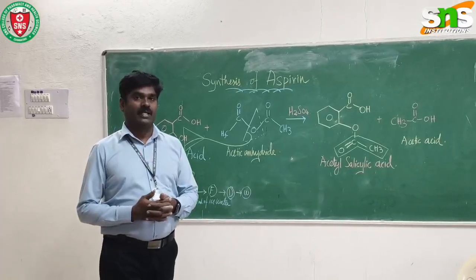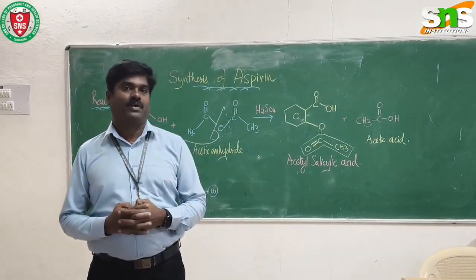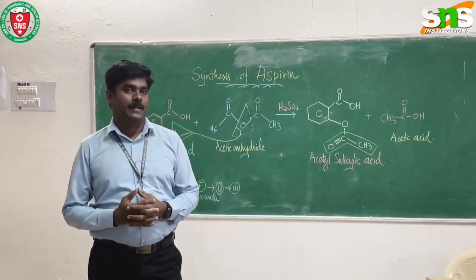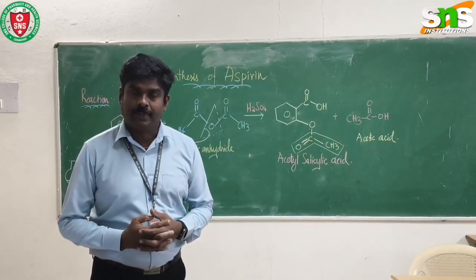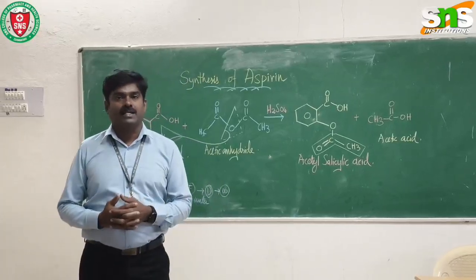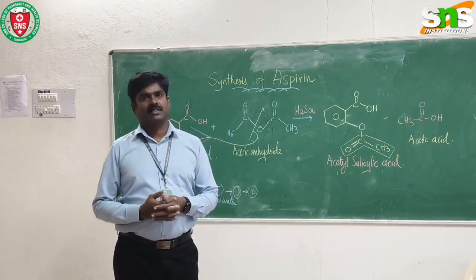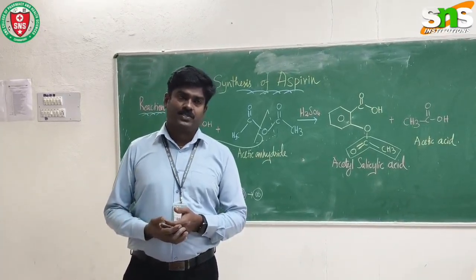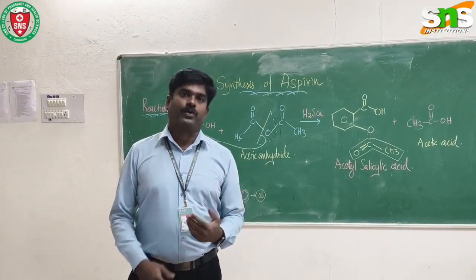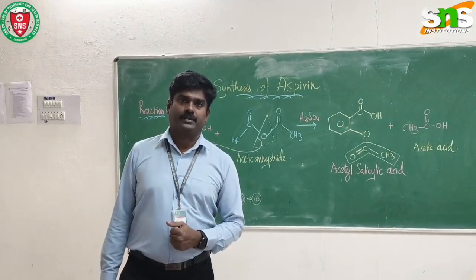You think aspirin is only essential for pharmacology? Yes, it is a very essential drug, and it can be used as an anticoagulant and antipyretic, and it has other major pharmacological activities. Anyway, today we are going to see the synthesis of aspirin.